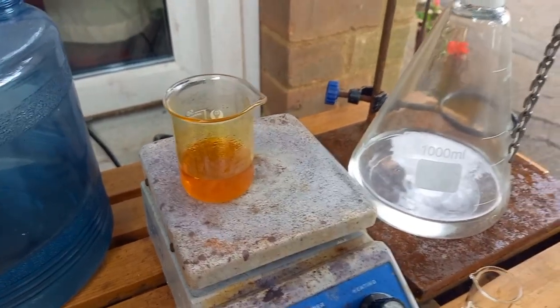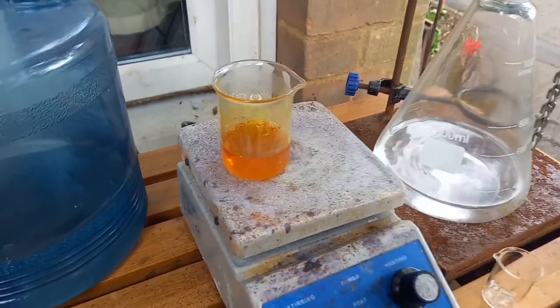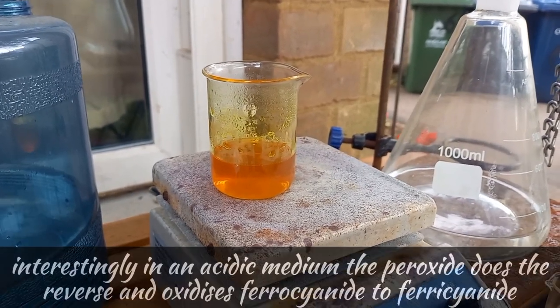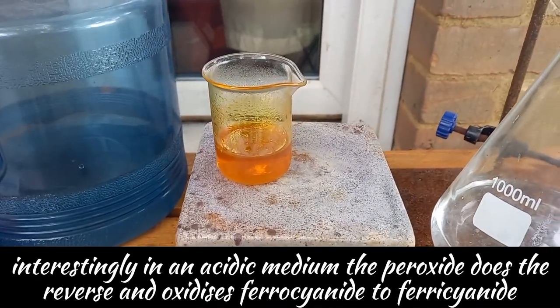Next we are going to add some hydrogen peroxide, which will hopefully reduce the potassium ferricyanide to ferrocyanide. I always get that wrong.